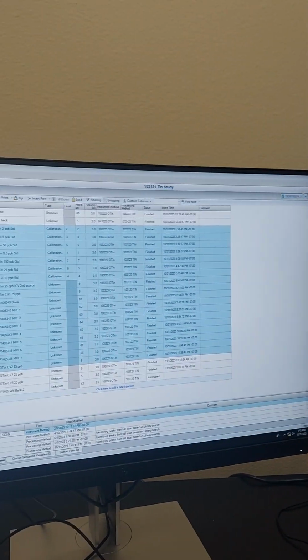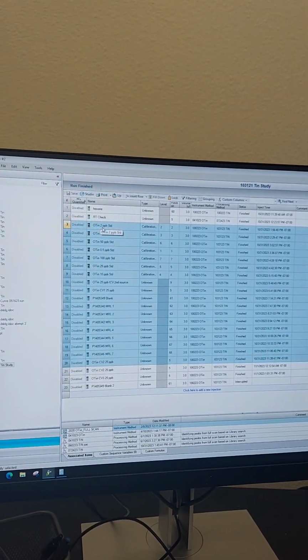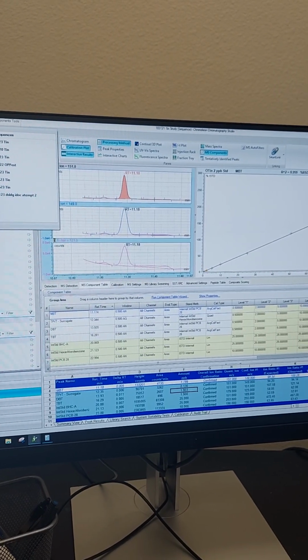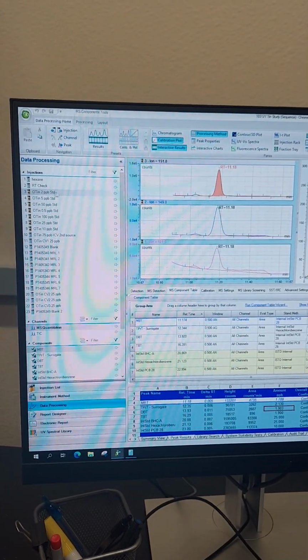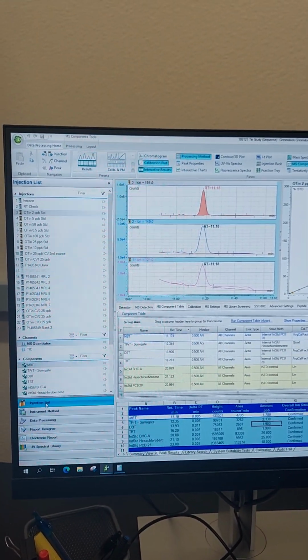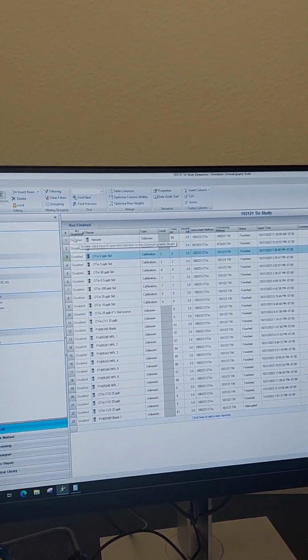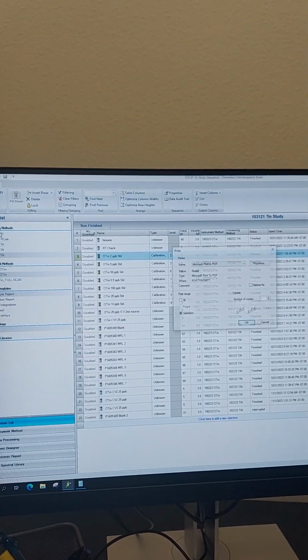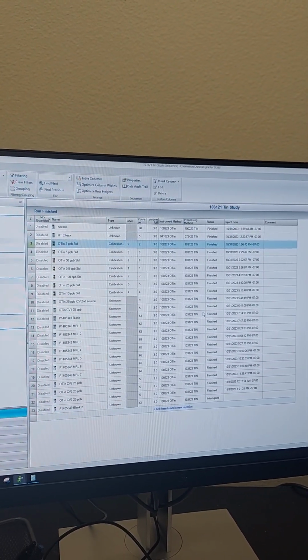So I just copy the print screen and report that way. But I'm not sure if there's a different way here, because in the office they don't have a different way to do that. How can you do that?